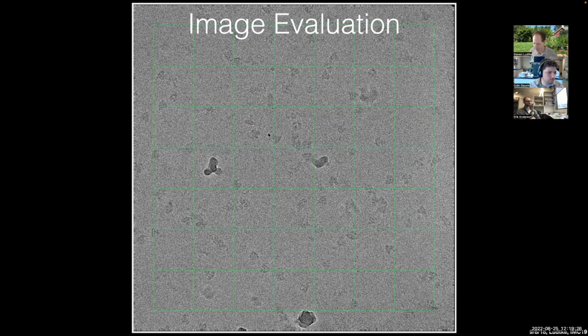That is also obviously not true, because, for example, that's not particle data and that's not a particle. And you say, well, I'm only boxing out the particles. But the assumption then is that there's nothing floating around in the ice other than the actual particles that you're trying to image. In other words, that when you purified your protein into pure water, with no other buffer molecules or anything like that.